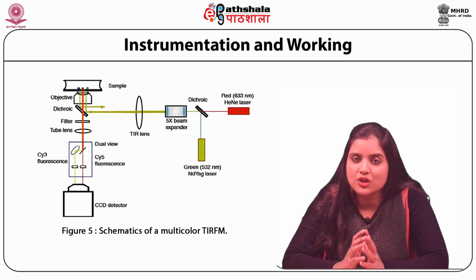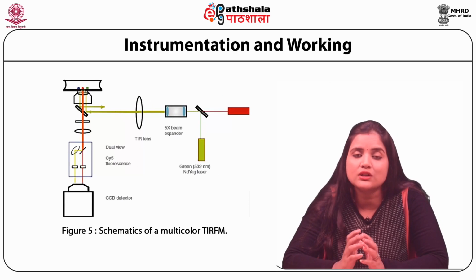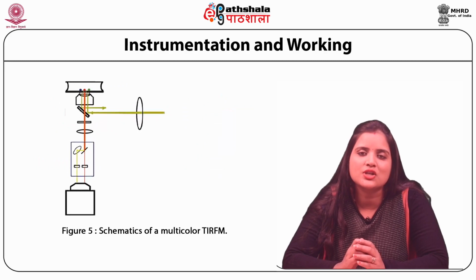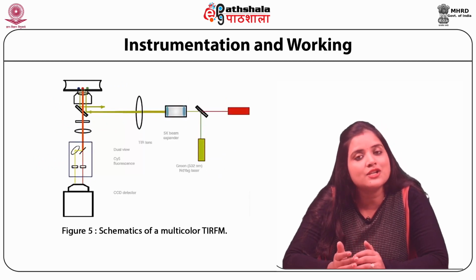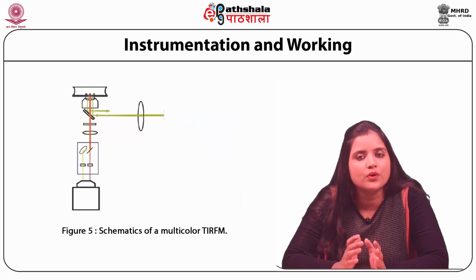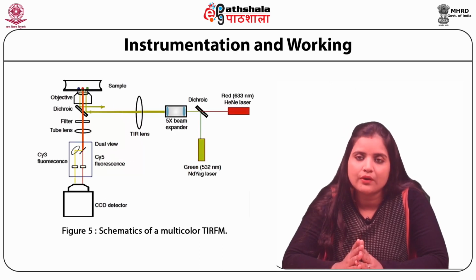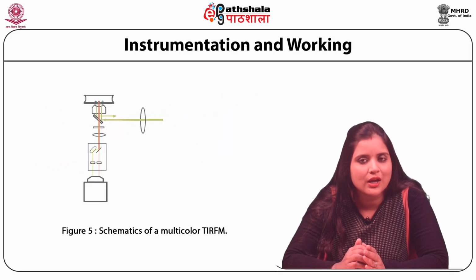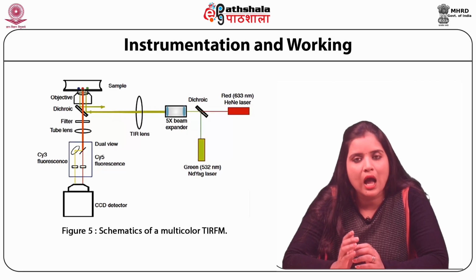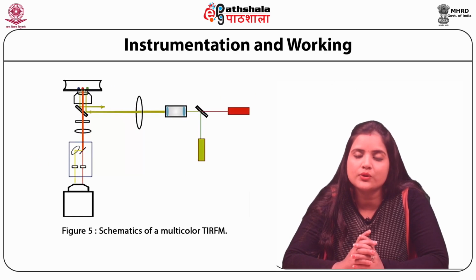The beam is then directed towards a kinematic mirror kept on a linear translation stage. This mirror reflects the light at 90 degrees and sends it towards the back illumination port in case of an inverted microscope. This step is optional. A suitable filter set is placed in the filter turret of a microscope and a circular field diaphragm is placed on the nosepiece.